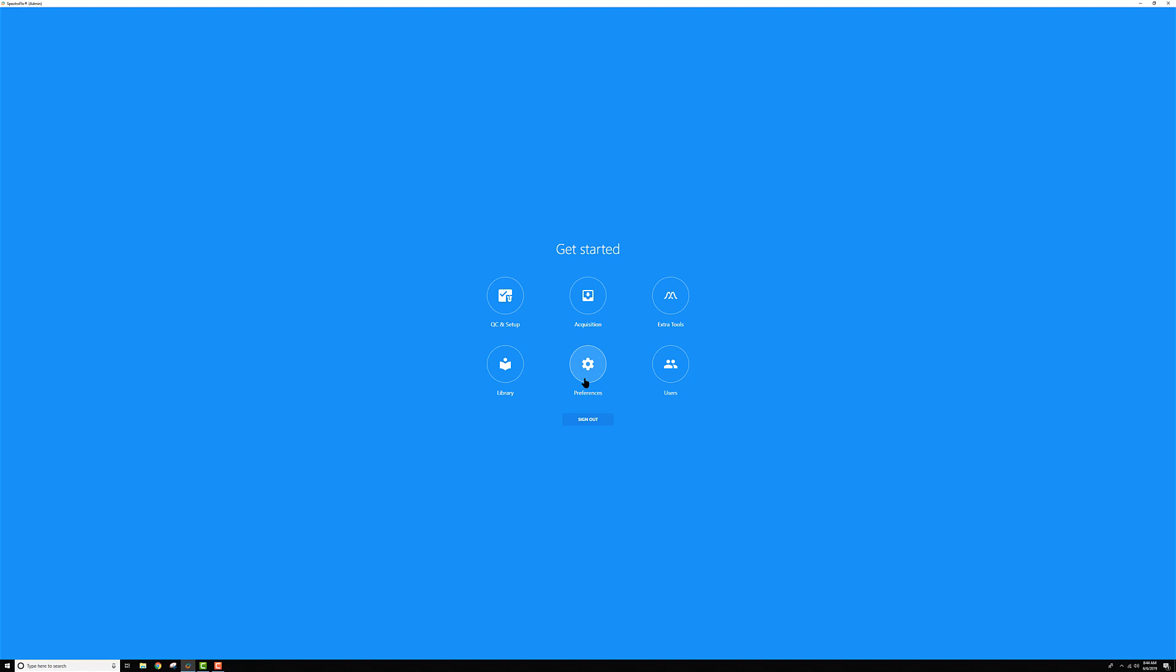The preferences section is where you can go to change the look and feel of your software, and there's also some default settings that are useful for when you're in acquisition or when you're creating worksheets, and we'll go through that at a high level as well.